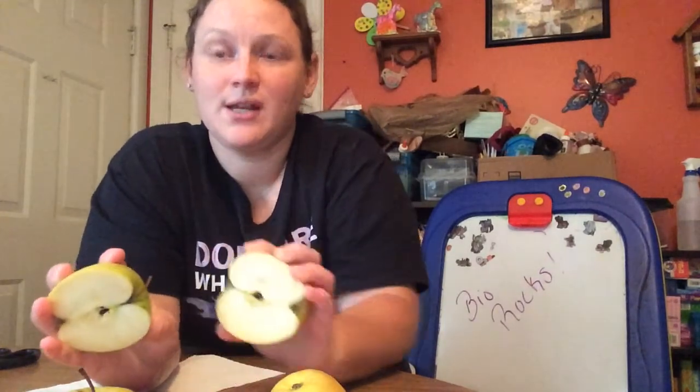Alright, so if you were following along, great job. Take a minute to sketch what you see and label your sketches. Okay, if you're doing it on your own, go ahead and get started.